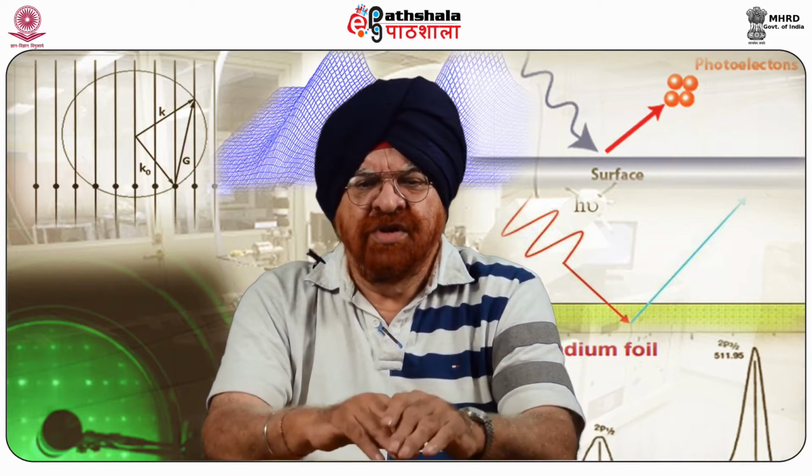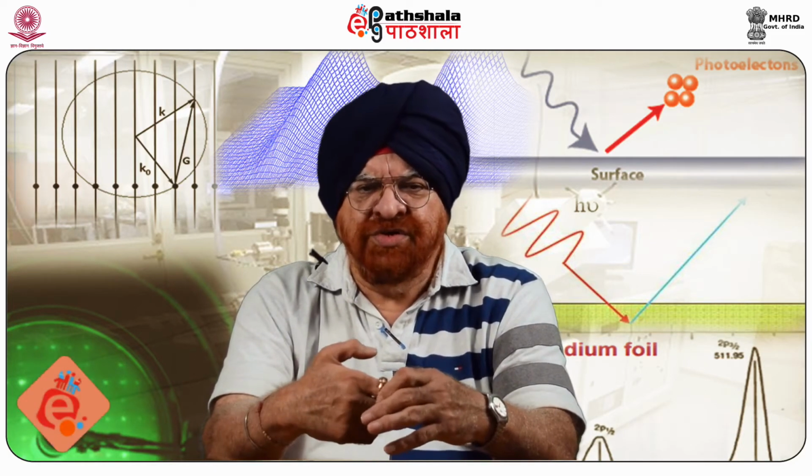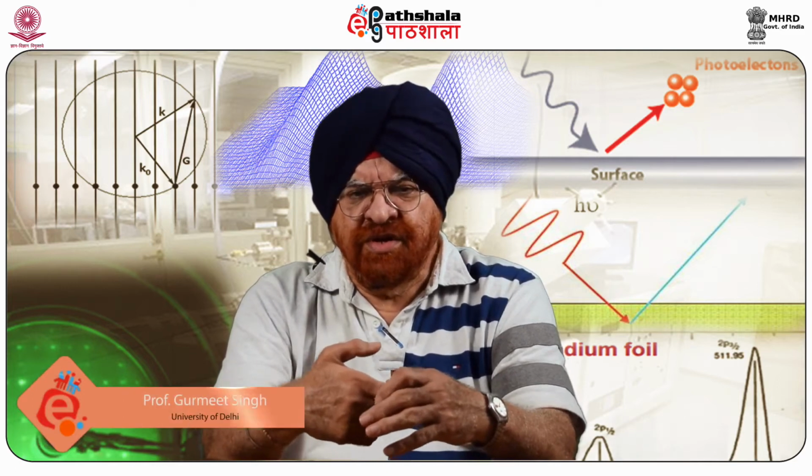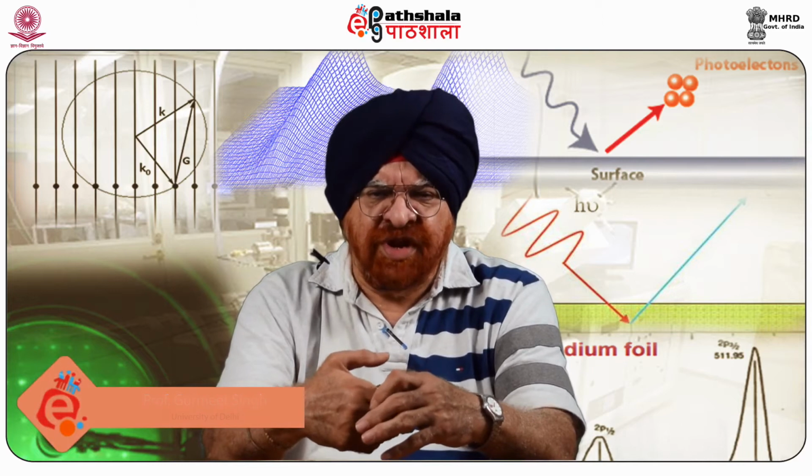This kind of superior resolution for biological applications we have not noticed in the other techniques that we have been talking about for surface analysis.